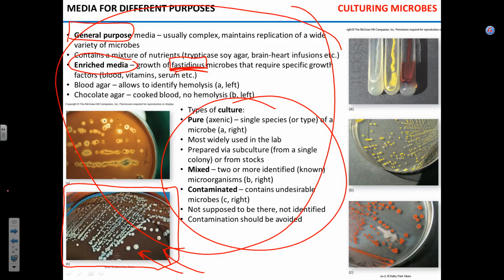So iron is good. Here's the cooked blood. Here's not cooked. So this is so-called blood agar. The undenatured, good, fresh sheep blood is added to agar. Erythrocytes stay intact. Some bacteria can lyse red blood cells. This is called hemolysis.